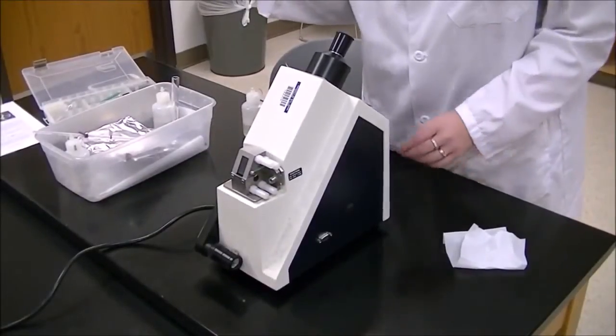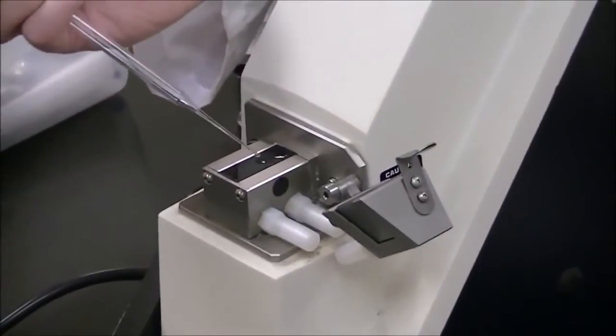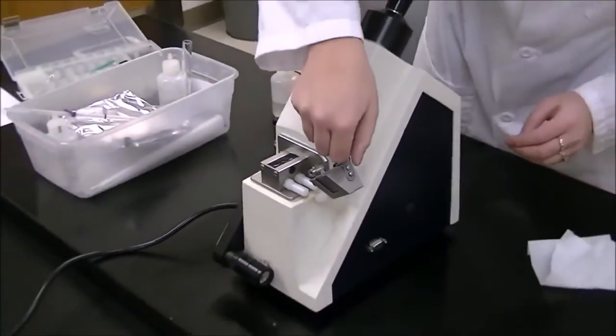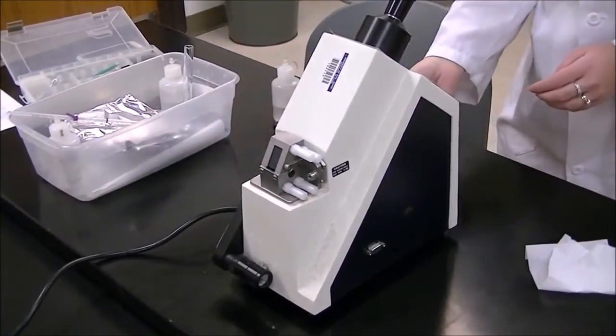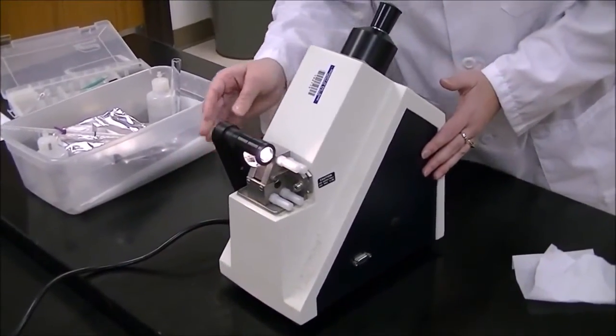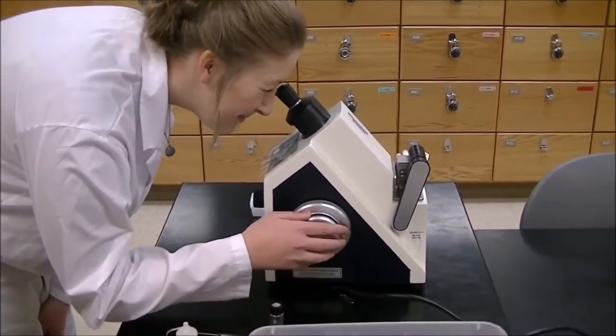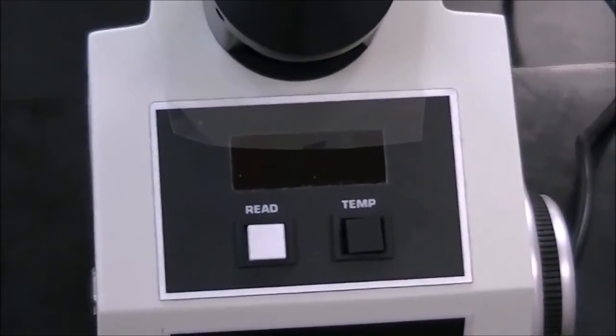Now we're going to show you how to take a sample on the refractometer. Open up the prism and put your sample on the base of the prism — just a couple drops will do. Then close the prism, turn on the light at the front of the refractometer, and bring the base of the light until it touches the prism. Now you're ready to look through the eyepiece. While looking through the eyepiece, adjust the focus knob until the horizon is directly on the X. Make sure to adjust so the cross of the X and the horizon line up — if you need help, your lab TA or instructor can assist. Once the horizon is lined up, press read.